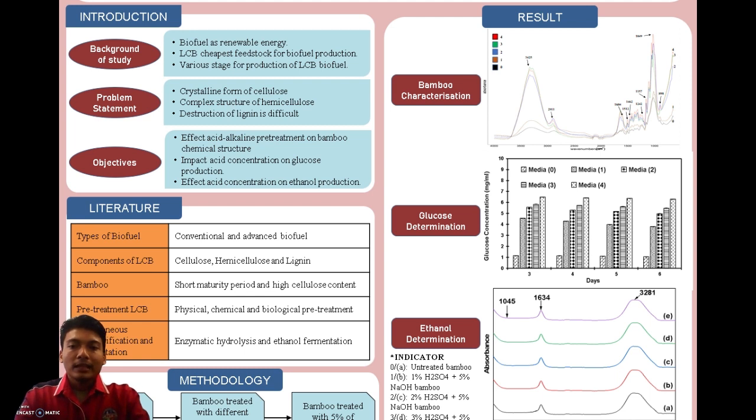For the first analysis, the chemical structure of bamboo after the pretreatment was analysed. Significant changes can be observed in the IR spectra of the bamboo composition after undergoing the pretreatment stage. There was an apparent formation of firm peaks around 3425 and 2911, indicating the OH and CH functional groups. Even so, the peaks here can be ignored since they are due to the remaining water in the sample and are far from the bamboo fingerprint region.